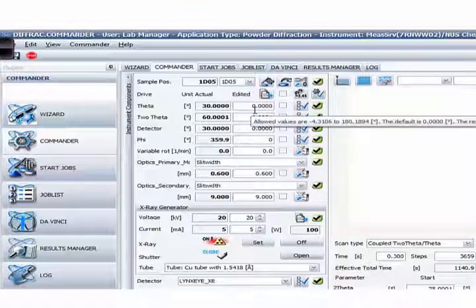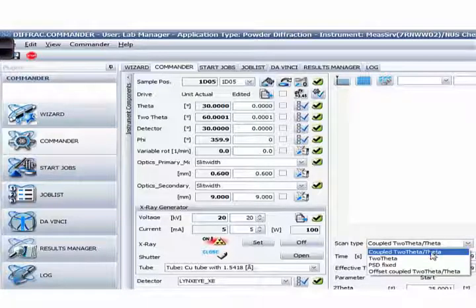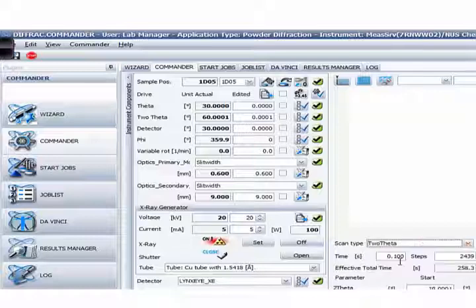If you want to measure your samples, all you need to do is key in your start and stop angles here, your increment in degrees, and the time you want. This is exactly the same as the old Commander you're used to. The scan type is continuous. This new system also allows you to do different scan options — the most common one will be coupled two-theta/theta, and some users ask for two-theta only, meaning you fix your theta position and your two-theta scans. These two are the most common scan types.